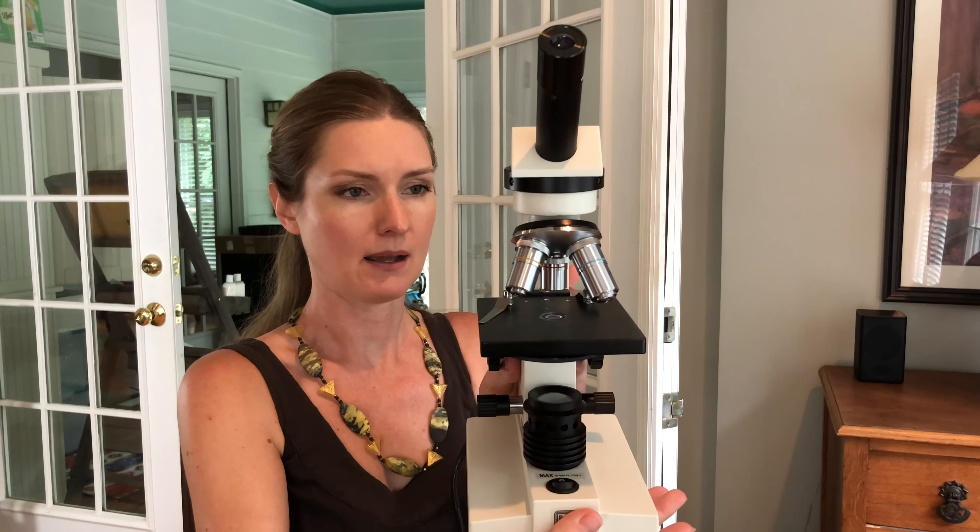I'm going to show you some of the supplies that you need to do this. Obviously, the first thing you're going to need is a microscope. This is going to be the most expensive thing, but it doesn't have to be all that expensive. What I've got here is just a student microscope. It's got three magnifications: 4, 10, and 40. The 4x is actually enough to see the eggs — it's really all you need.